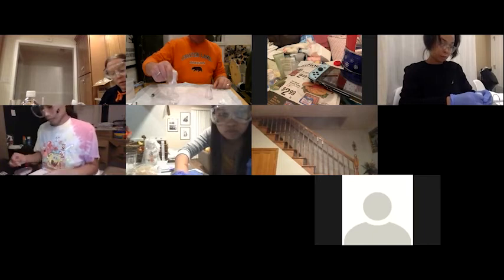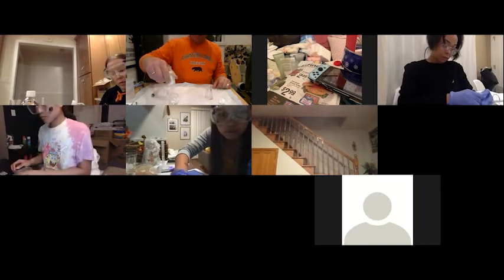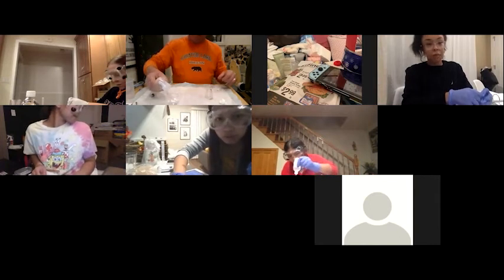If your hand gets tired, you can use both hands. You can use the other hand. Okay, that'll be enough.